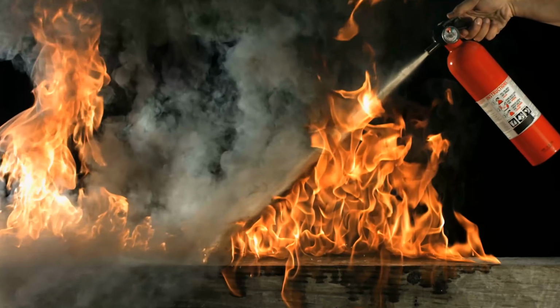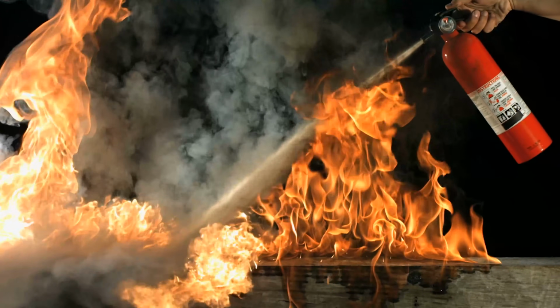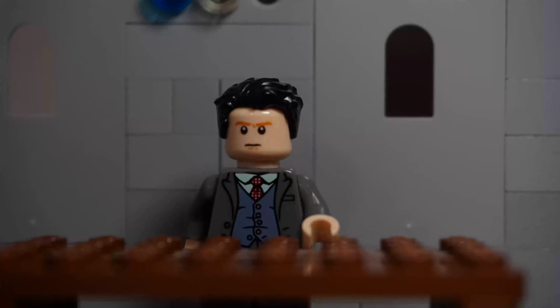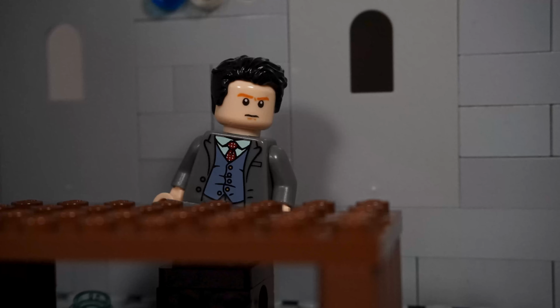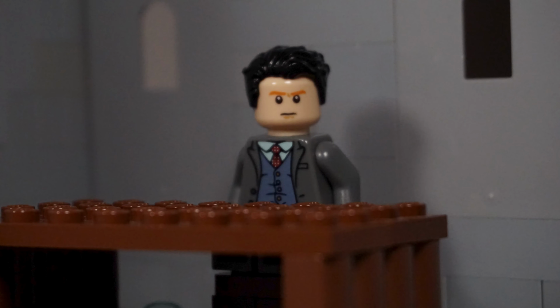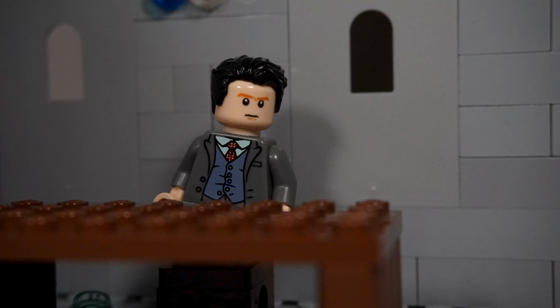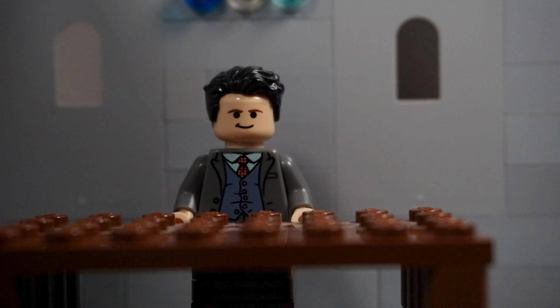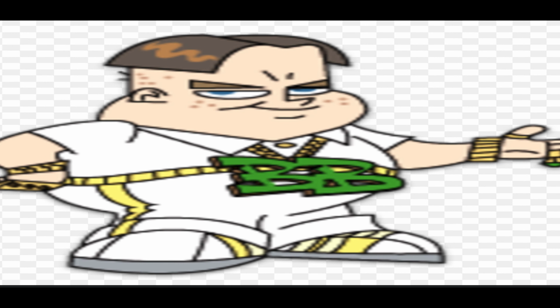However, make sure that chemicals from the fire extinguisher do not react with the chemical that is on fire, as they can make the reaction worse. One of the biggest reasons fires begin in the lab is because somebody was not wearing appropriate clothing for the situation. Always make sure to not have sleeves or bulky clothing that could catch on fire. Also, if you have long hair, it needs to be tied up in some capacity. A few types of fabric should also be avoided, such as silk. Long jewelry, like a necklace, should also not be worn, as it can fall into chemicals or fire.